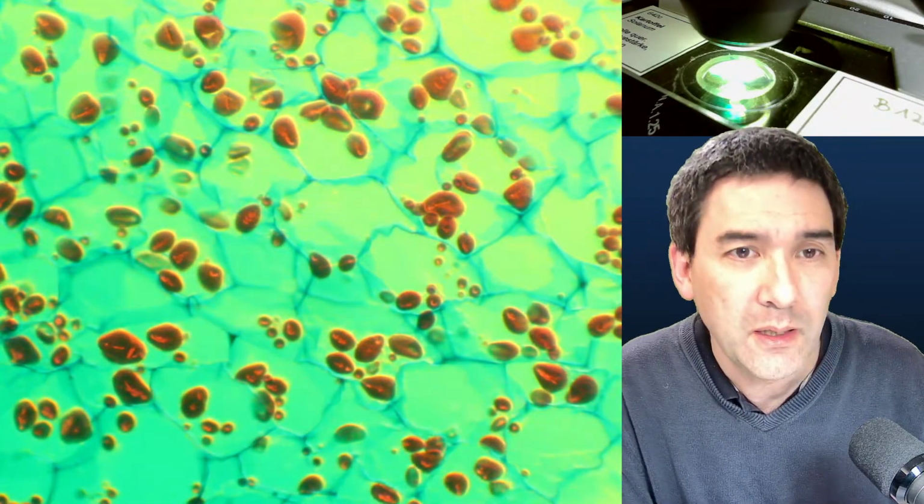However, what I think is the interesting thing is when you're using specimens that do not contain a color, right? For example, those radiolarians, or for example, I've got a whole bunch of others here. Yeah, the diatoms here.